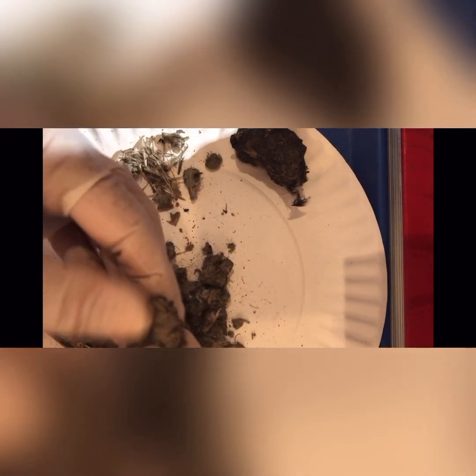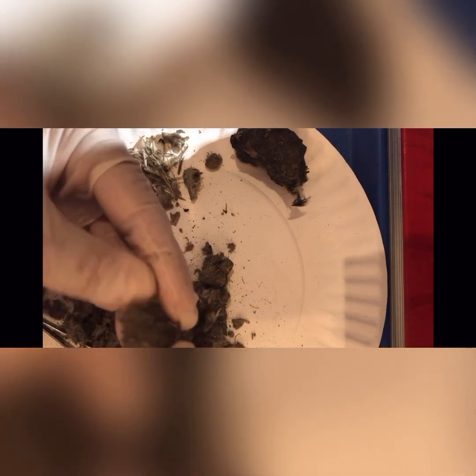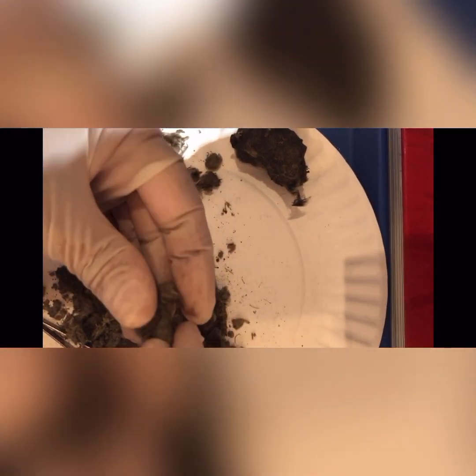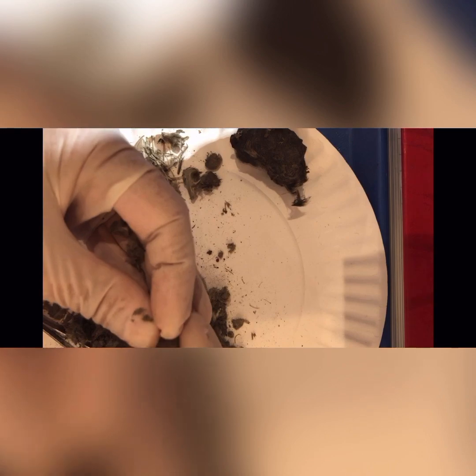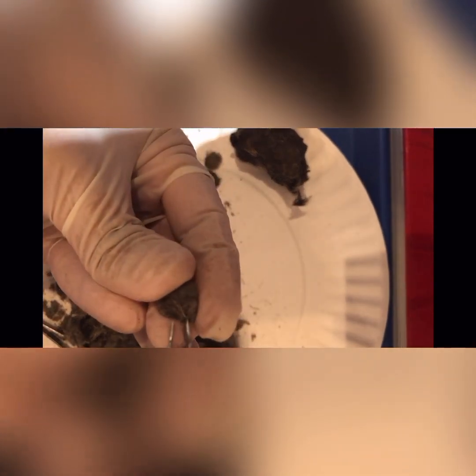Put that off. I think we have the majority of our bones done. I'm gonna keep picking at this until we see that we have nothing left but the fur. So the fur we're not gonna do anything with. The fur doesn't really help us identify the animal.